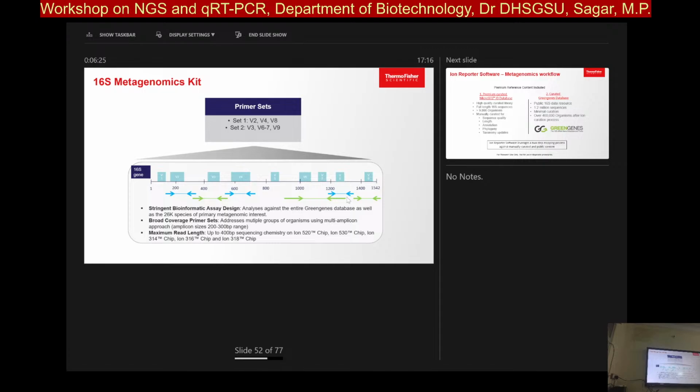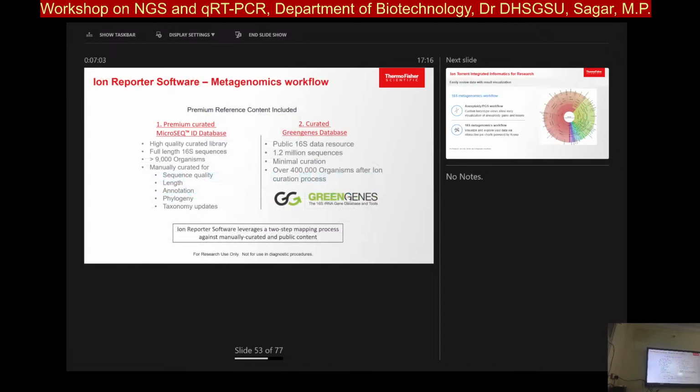You must have processed two pools, merged them together, used that data again, and taken them equimolar to pool them together in one single system. Okay? So you are doing that over here. So the overall idea is to target each and every variable region and get the data for each sample. With that data, you are still looking further to merge it with consensus, so your counts can be merged together and your proportions could come further out of it. So you're doing a 400 base pair sequencing, because you have a longer length region coming, 280 base pairs, so to be on the safer side.